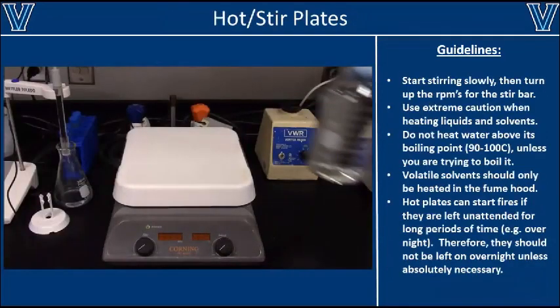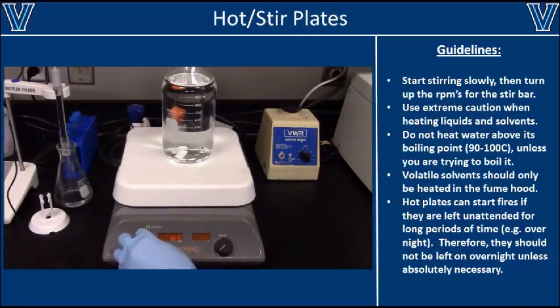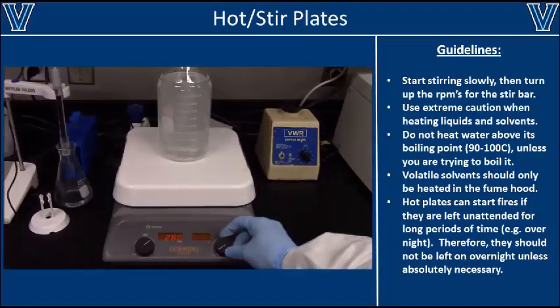Once you have your ultrapure water, you probably use a stir plate to make your solution. Begin by inserting a stir bar that isn't too big or too small for the bottle. Then slowly turn up the RPMs and add your chemical that you wish to dissolve. In some cases, you may wish to heat the sample as well.